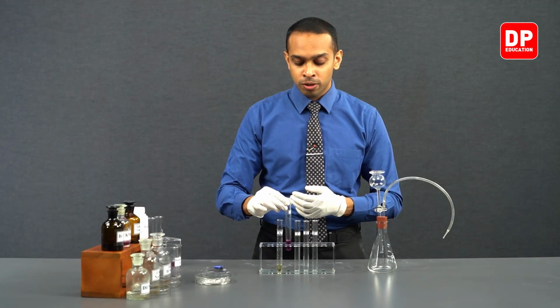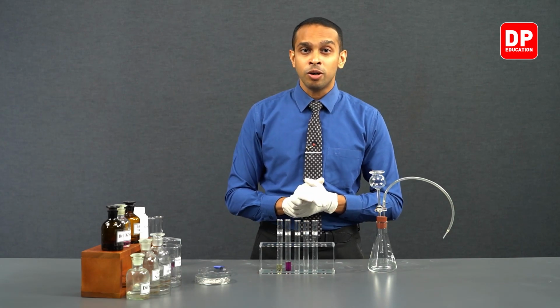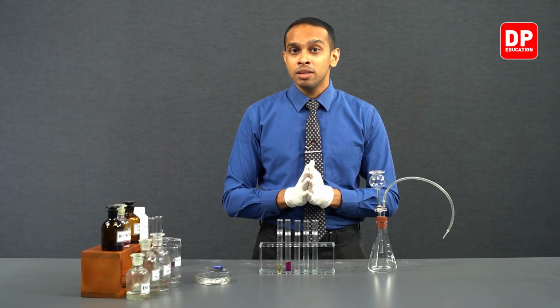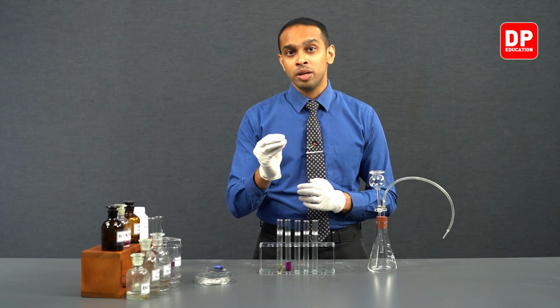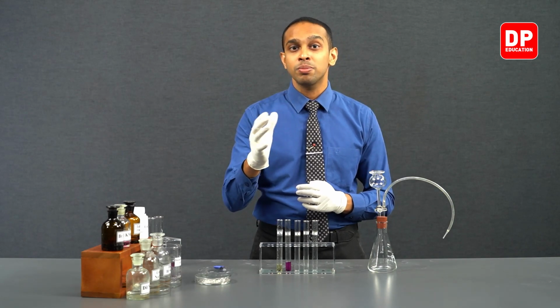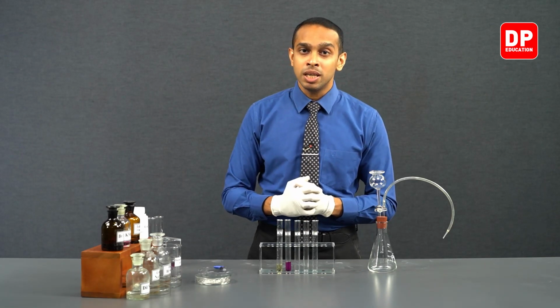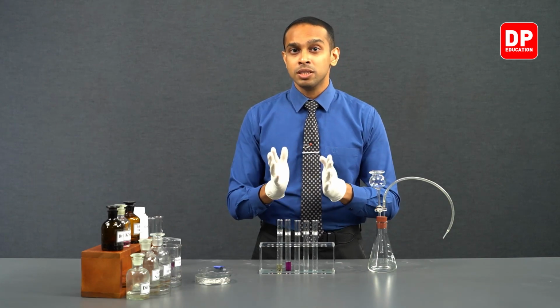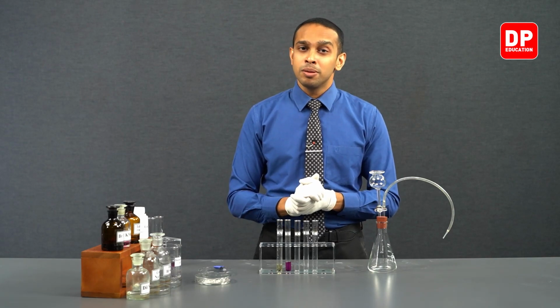The reason for the brown color that you will observe is the formation of manganese dioxide, a water insoluble solid which is brown in color. However, this brown solid is going to be produced as fine particles. They will get dispersed in the aqueous medium and will form a suspension. This suspension will make the aqueous medium appear brown.